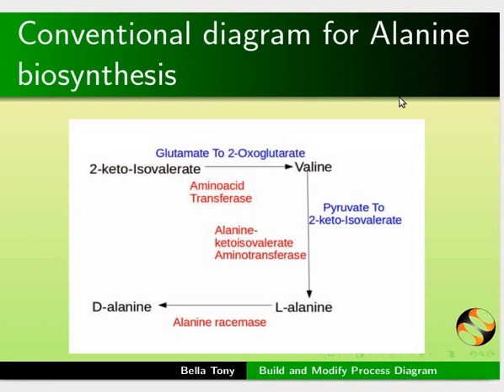Let us begin. What you see here is a conventional diagram for alanine biosynthesis. Now we'll use Cell Designer to create this process diagram.